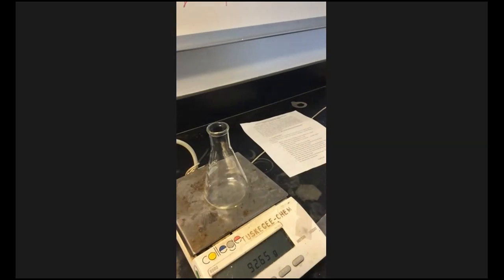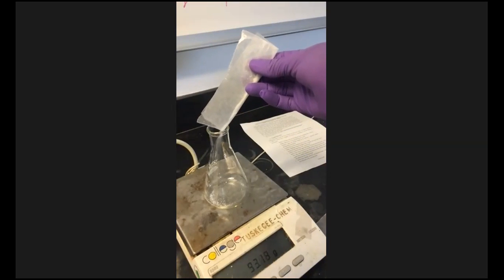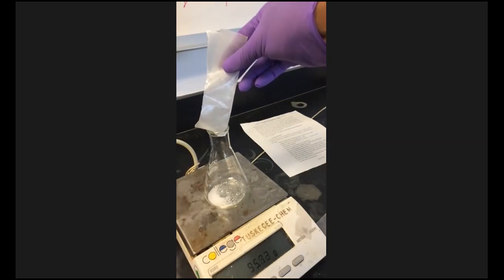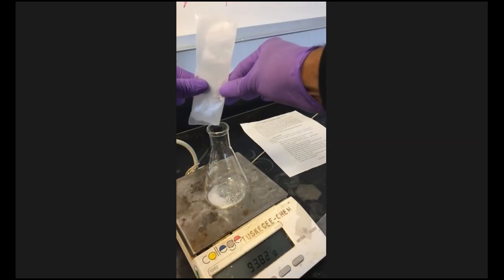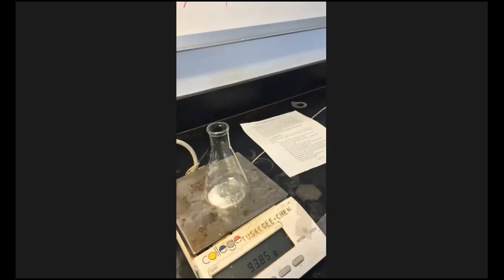So write that instead of 66, use 65. 92.65. All right, so I'm going to add the salt mixture right to it. And you can see the mass of the salt mixture plus the beaker is, can y'all see that? 93.81.